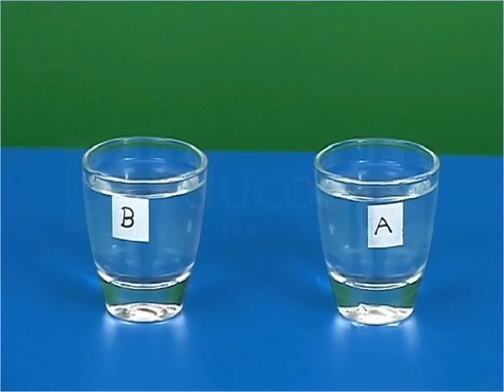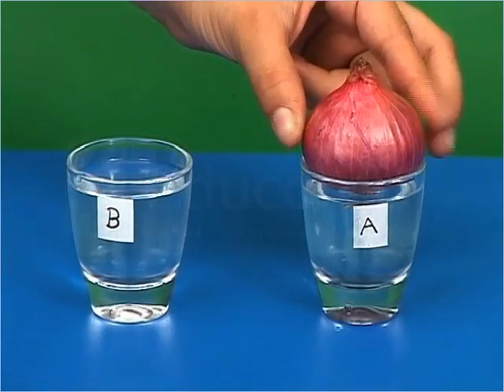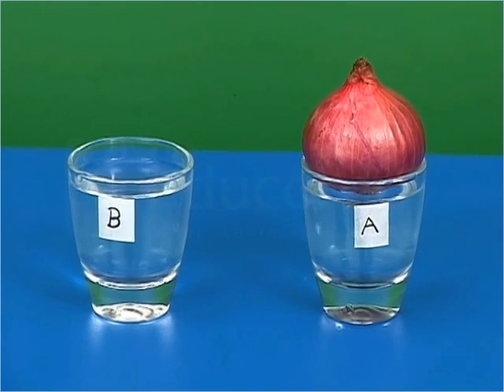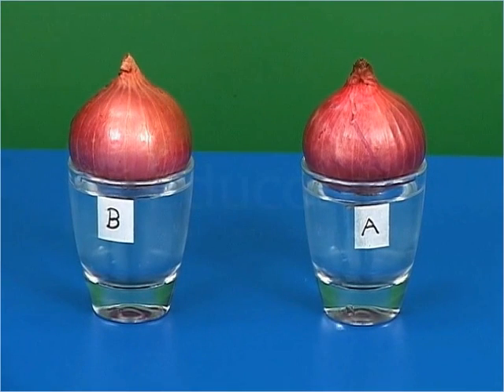Let us now begin the activity. Take two tumblers filled with water and mark these tumblers as A and B. Now take two onion bulbs of the same size and place one in each tumbler such that only the lower surface of the bulb is in contact with the water.